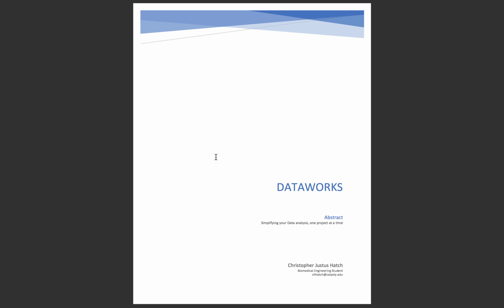My name's Chris. I'm going to be talking about my CSC project today. So the title of it is DATAWorks. What this program is designed to do is to be able to create dose response curves and determine statistical significance between dose response curves for two different treatments with multiple inputs for those treatments.